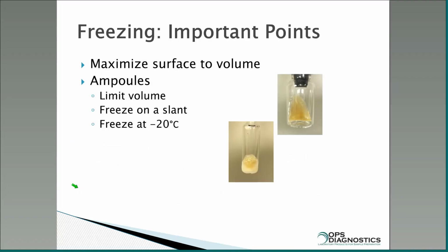All right, some important points. Maximize the surface area. These are just some examples of how I did this. Here we have a vial, which I literally put on its side when I froze it. There's 1 ml of freeze drying buffer in there, and you can see it's a huge surface to volume ratio, if you want to call it that.